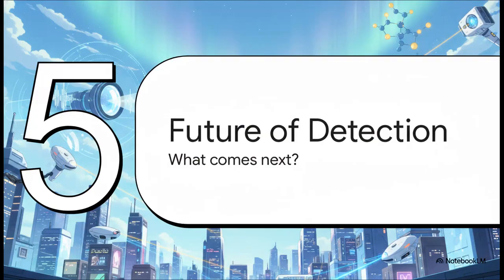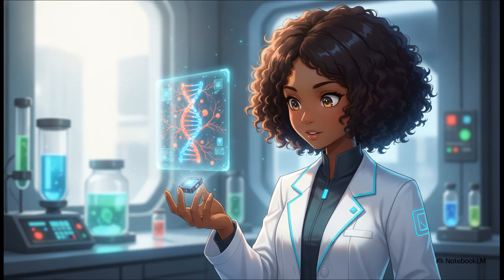And finally, Section 5, the future of detection. Where does this synthesis of optics and acoustics take us next? Well, the tech is evolving at breakneck speed. We've gone from Bell spinning slotted disks in the sun to utilizing futuristic continuous wave mid-infrared lasers. Miniaturization is huge right now too. We're shrinking those massive, bulky laboratory setups down to portable field sensors using sleek silicon tech and 3D printed resonators.